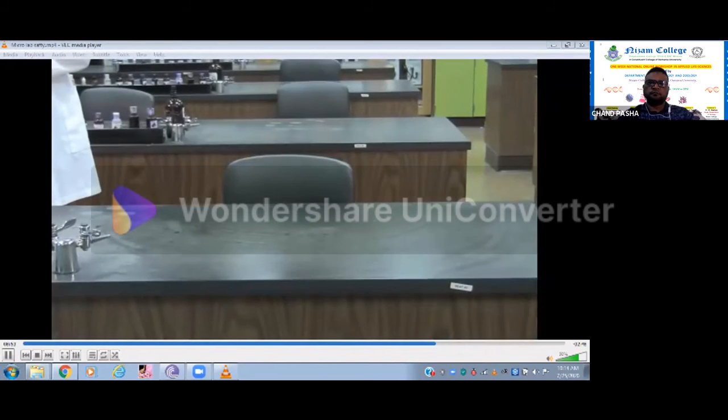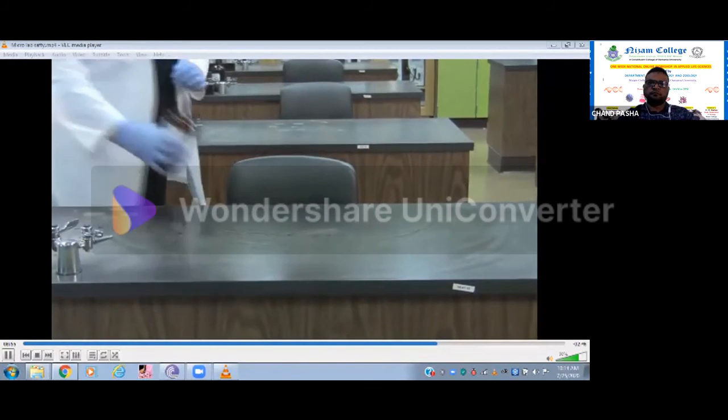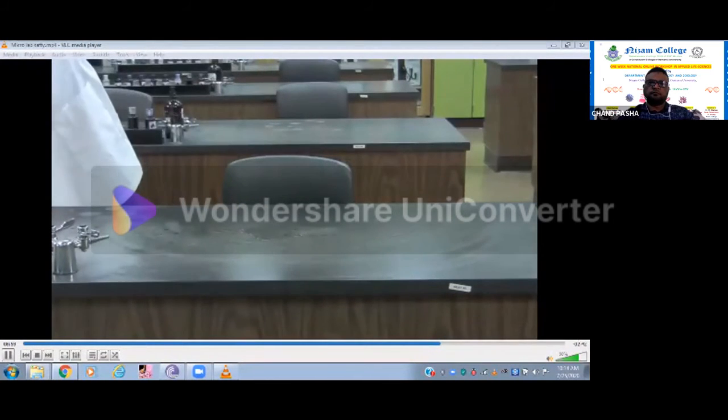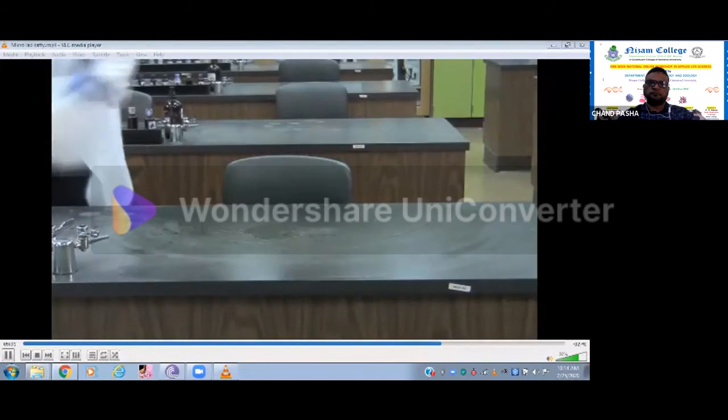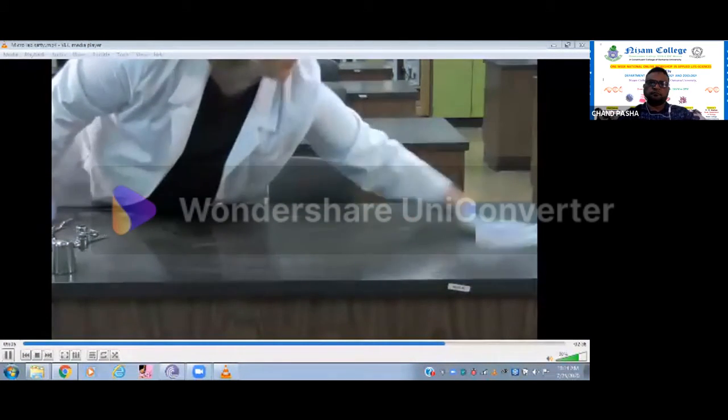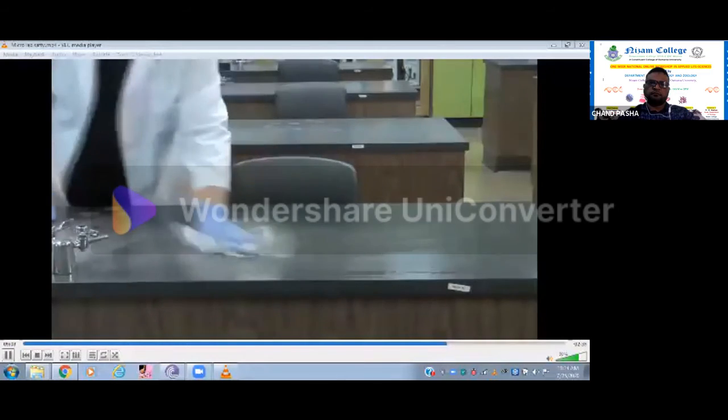Before and after each lab period, pour a small amount of disinfectant from the brown bottle on the lab bench onto the lab bench and wipe down with a paper towel. If you run out of disinfectant, the supply carboy is on the sink at the back of the room.